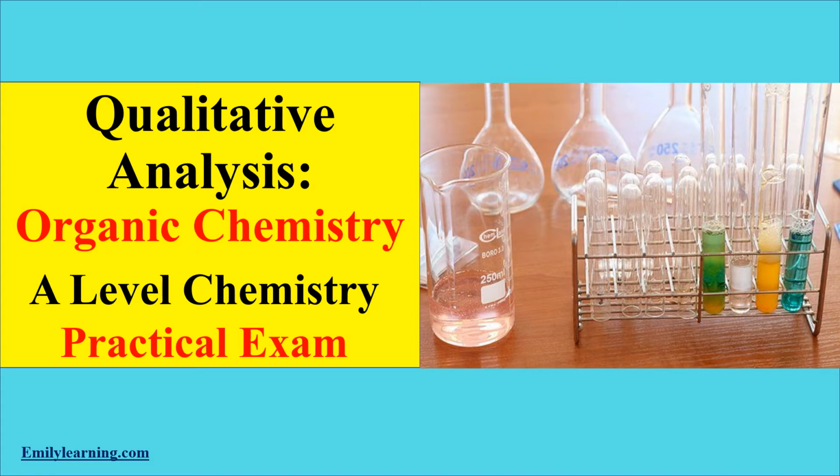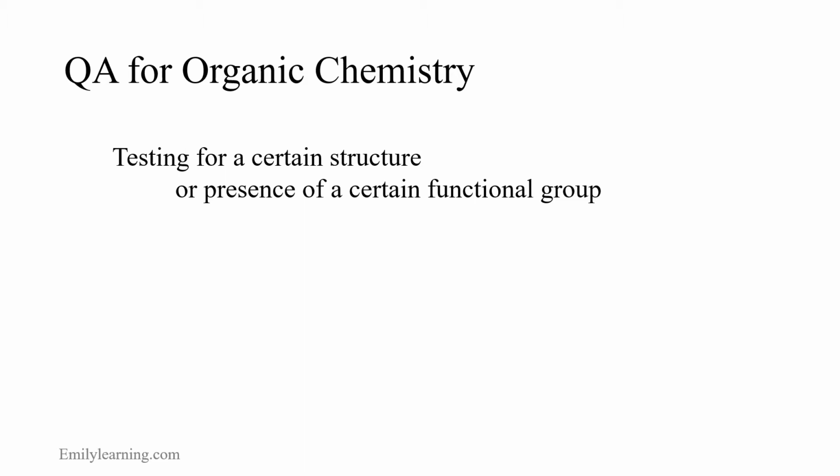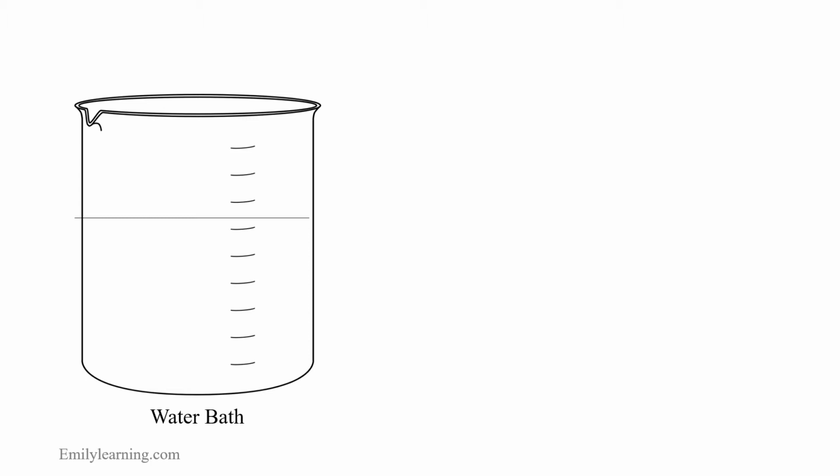So let's get started. All right, so for the qualitative analysis practical that involve organic chemistry, most of the time you will be asked to test for a certain structure or the presence of certain functional group. And for some of the questions, they will ask you to heat it in a water bath.